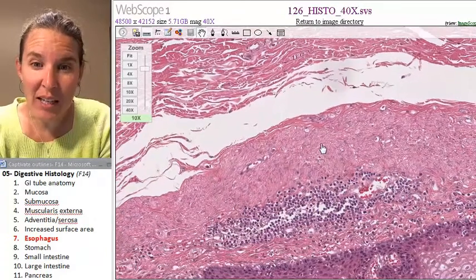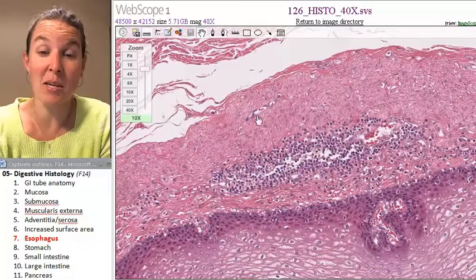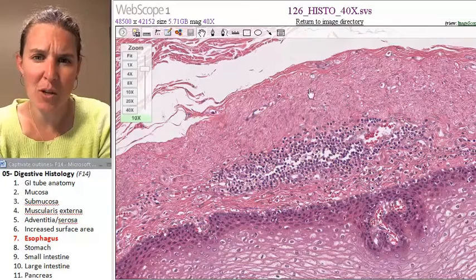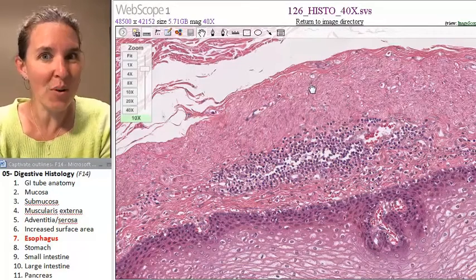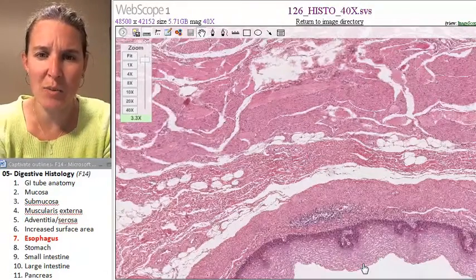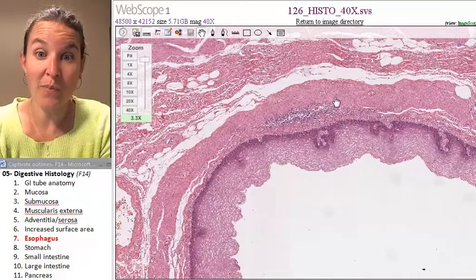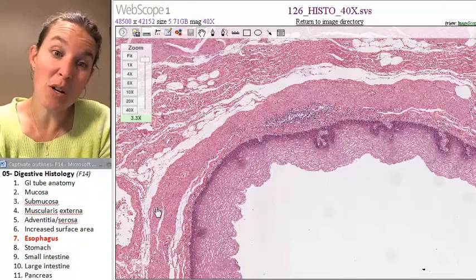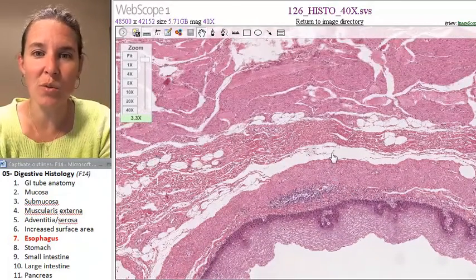Looking at this, I would guess this might actually be my muscularis mucosi right here, and this is my lamina propria. The muscularis mucosi in this one actually looks pretty thick — you're not always going to have it be that clear. So: epithelial tissue, lamina propria just deep to that, muscularis mucosi which is pretty thick in this case, and then we move into submucosa.